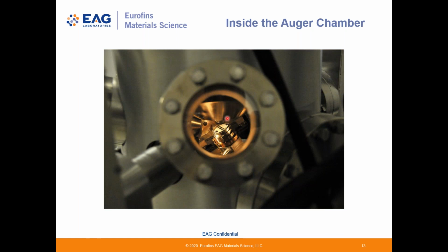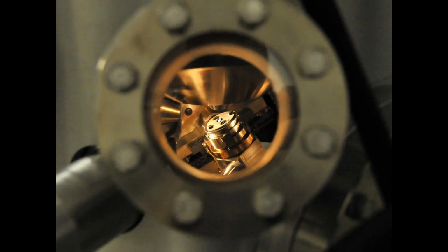Here's a look through our viewport, and we can see the sample on our stage. In this system, we are limited to a 1-inch diameter sample holder, but we do have other systems capable of much larger samples. Note that the sample is tilted 30 degrees with respect to the primary beam, which comes from this center cone here.